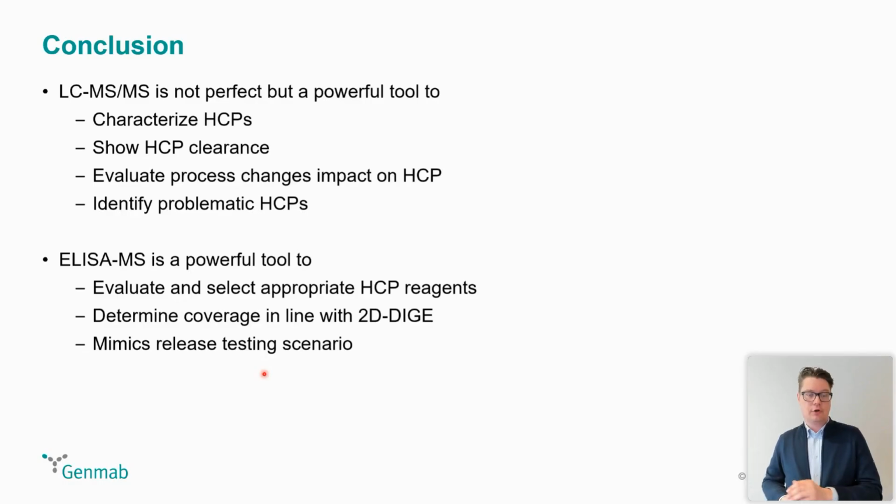It does determine coverage in line with a 2D DIGE approach, if you want to look backwards a bit. But as I said, it also really mimics a release situation. So we found that very valuable as well, to be able to do that.